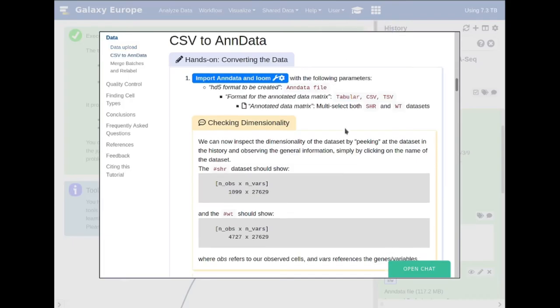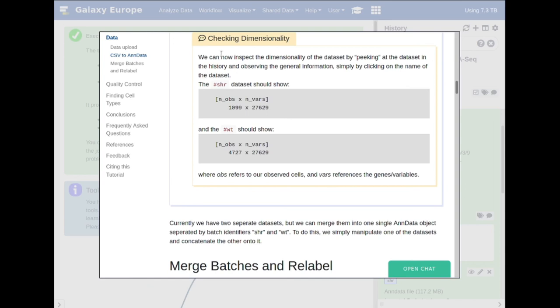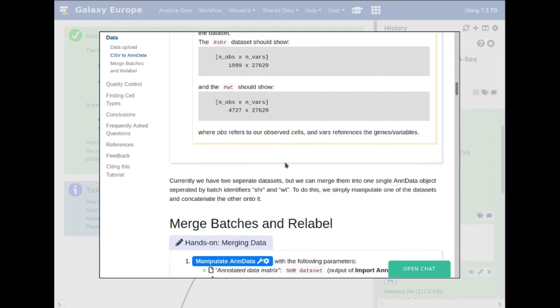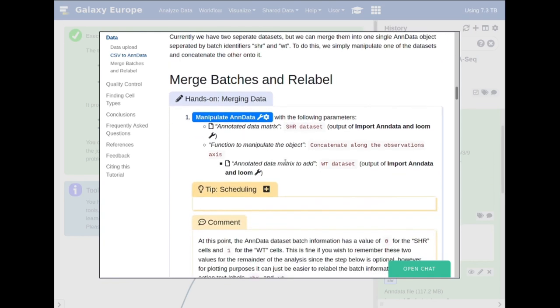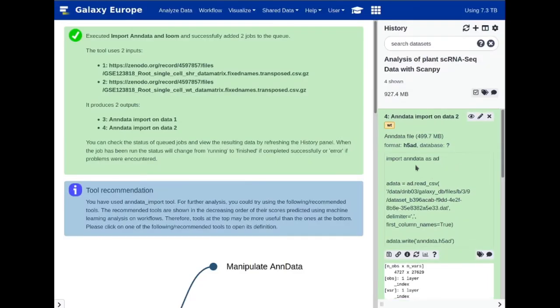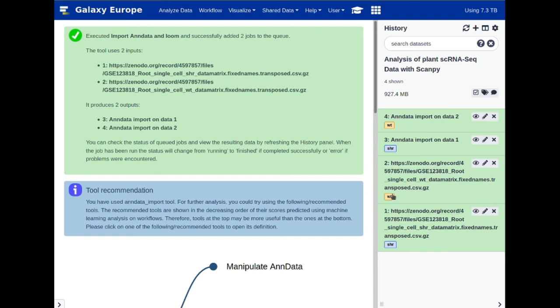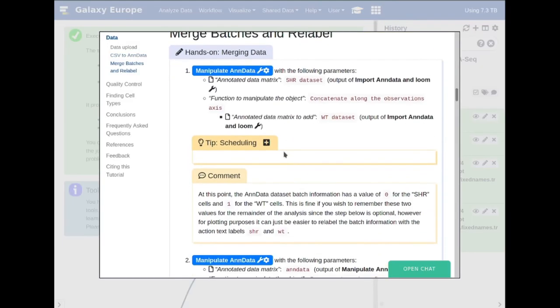Let's go back to the tutorial. Just by looking at the observations and variables, we get an idea of the dimensionality of the dataset: around a thousand observations and 27,000 dimensions or variables, which at some point we will have to reduce to fit into a nice two-dimensional graph showing which cells cluster together. At the moment these are two separate files, and we wish to combine them into one combined AnnData file. AnnData allows you to have multiple batches — in this case wild type and short root — within the same file.